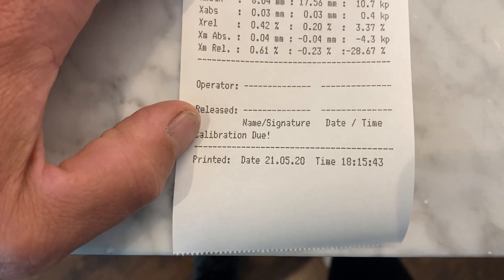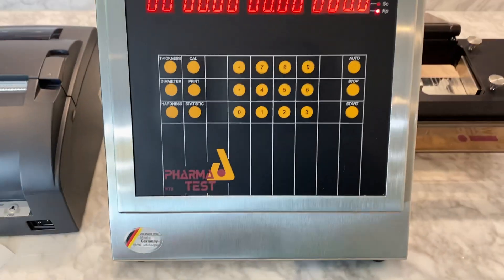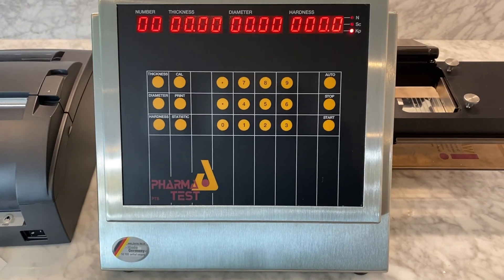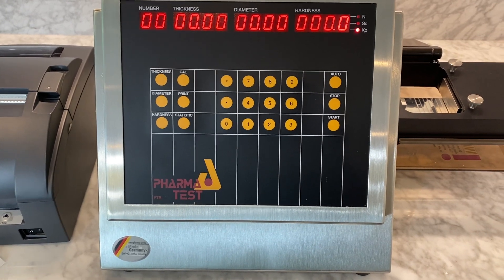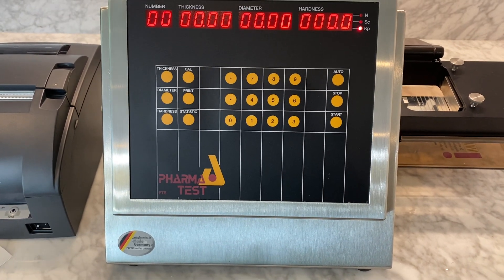It will even let you know if the unit was in a calibrated state or not. The PTB 511 comes with a two-year warranty, IQOQ documents, and is manufactured by PharmaTest, which has been in business for 40 years.